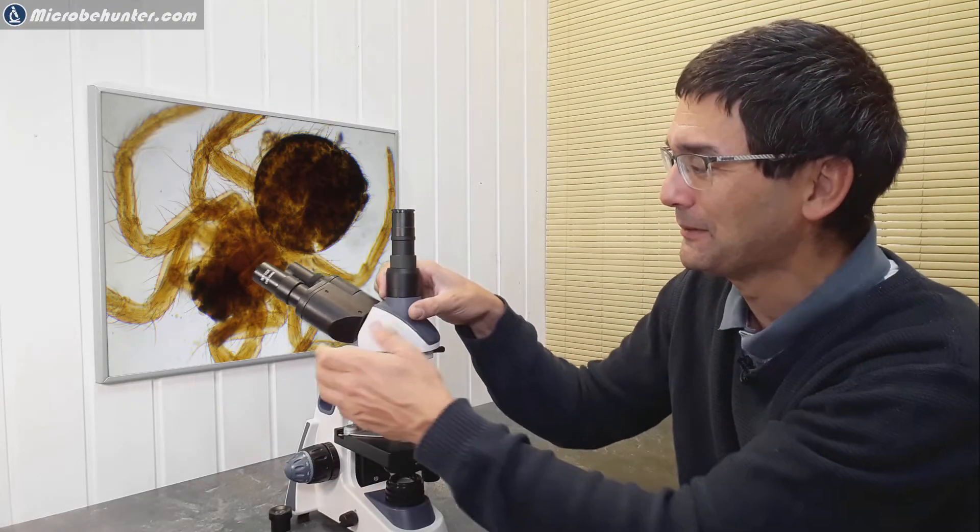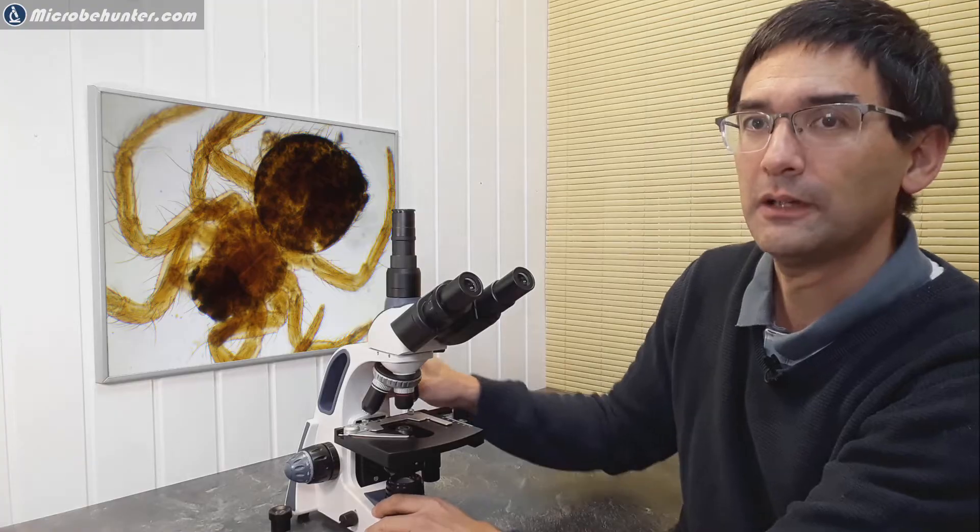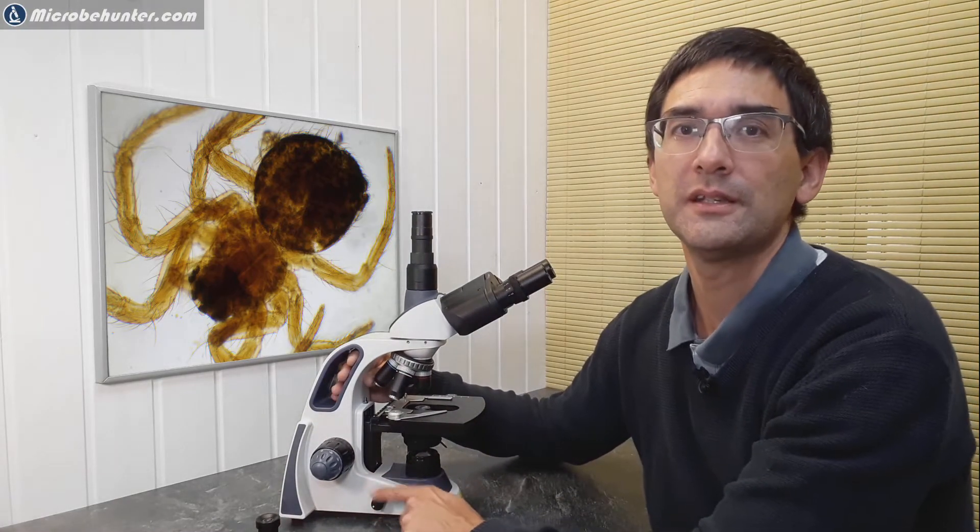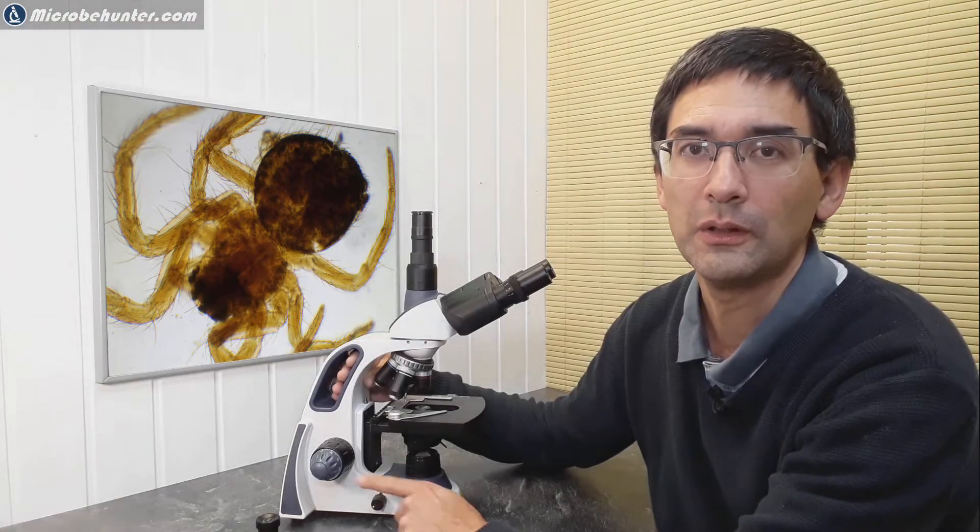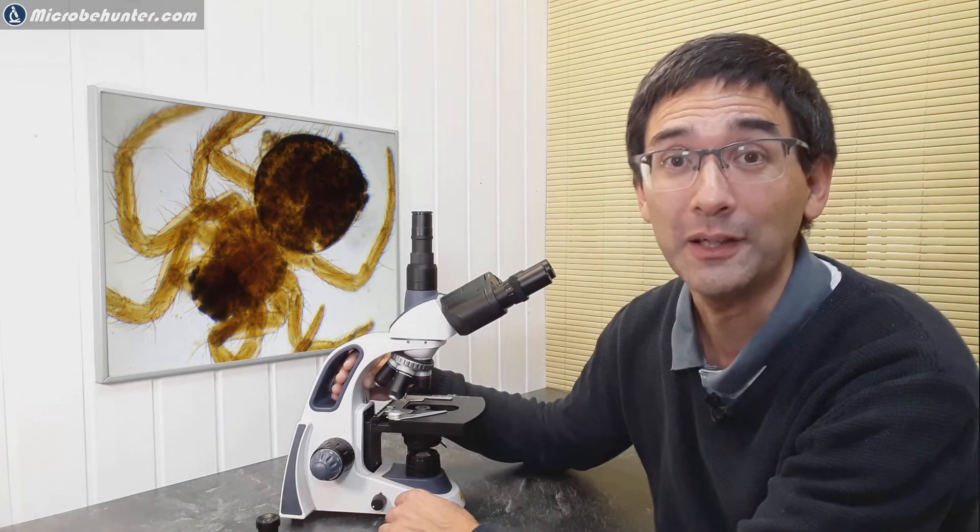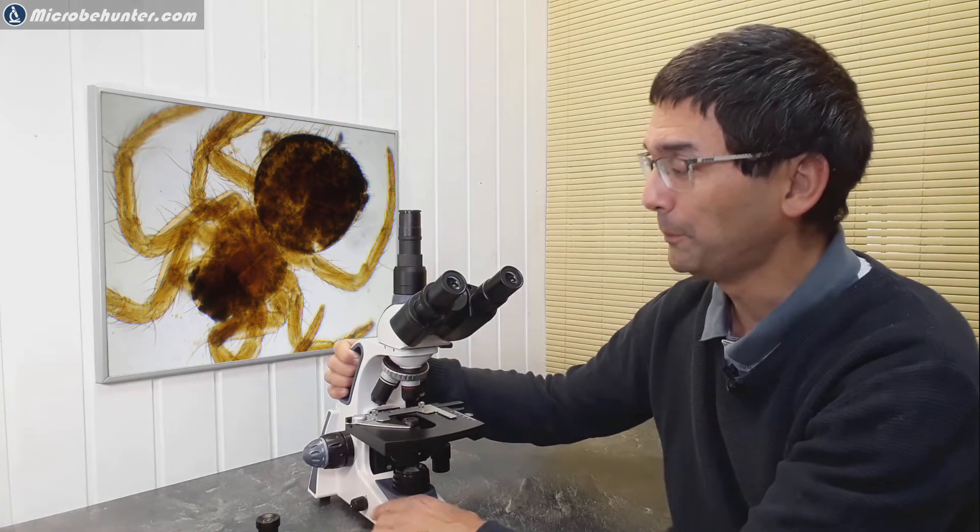What else do we have here? On the side here, down here, this is the light intensity control. It's an LED microscope and I would say that the LED is quite bright.